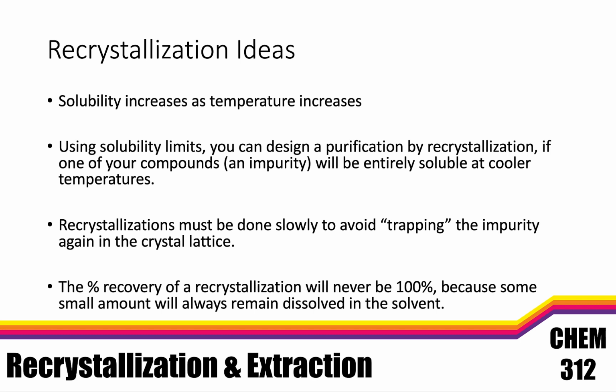One of the things we're going to calculate is what's called a percent recovery, and there's practice for this in the PDF, and there's actually a guide at the end of the PDF that walks you through some of these calculations. But the idea of percent recovery is it'll never be 100%. You'll never get all of the material out of your solution because some of it will always stay dissolved in your solvent, even if it's a small amount. So in general, if you get 100% recovery, you might have done something wrong in your calculation and you want to revisit that, because almost always, in fact, I will say always, you should get a number that's lower than 100%, if you have good crystals.